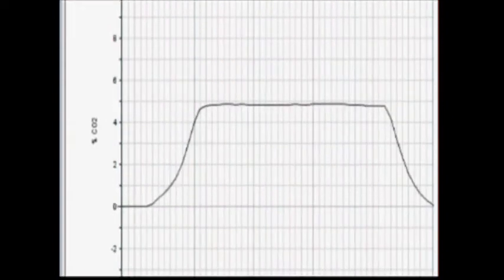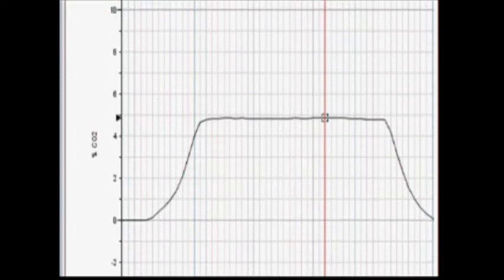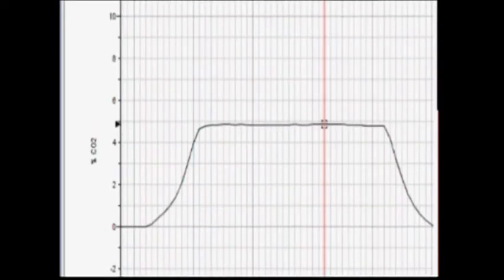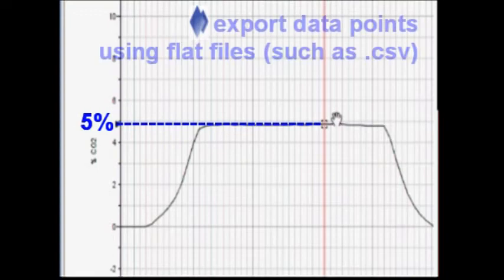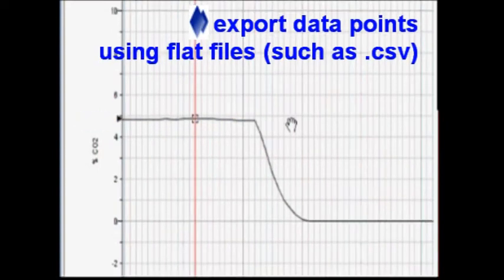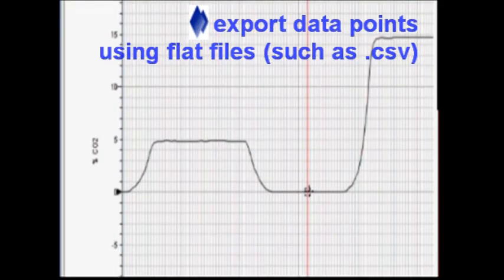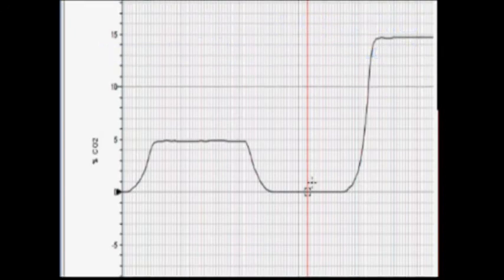We're going to zoom in here on the first plateau. As you can see, this is where we were flowing 5% CO2 through the analyzer, and you can see that plateau of data. You can export these measurements to platform-independent files, such as CSV files, and import them into your own data analysis software, should you wish to do so.